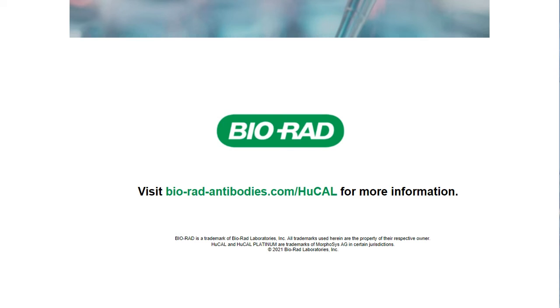Licensing restrictions prohibit us from making therapeutic candidates. So we can't make the drug compound itself, but we can make the tool antibodies to act as critical reagents in the pharmacokinetic or ADA assays that measure those drug compounds. So I hope that answers that question.